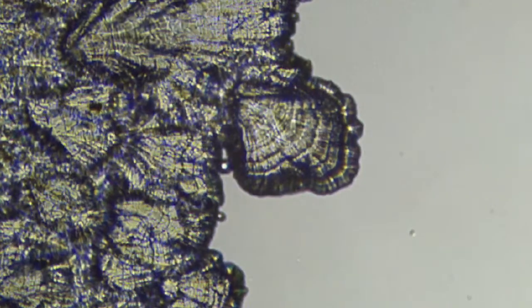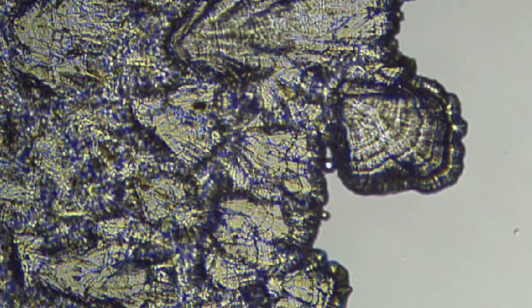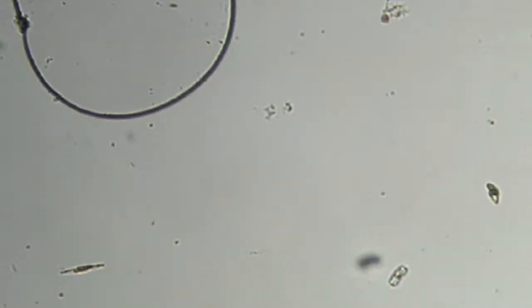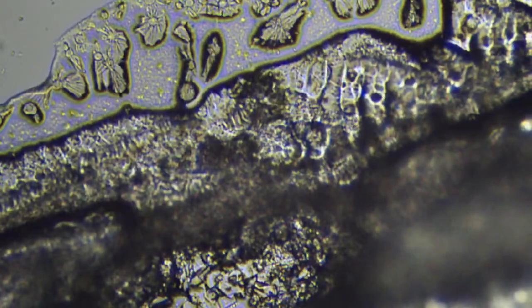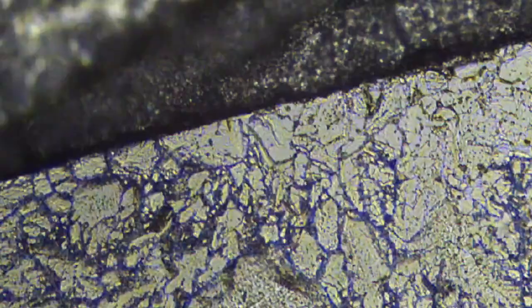But look at that. It's almost like a turkey tail fungus there, that kind of banding, radial banding. Really cool. You get some weird color artifacts from the polarized light. Pretty cool stuff. Yeah, it's all getting crusty on the edges here as the slide is drying up, lots of salts. Again, it looks like topographical maps or aerial photos of land masses from high altitude.